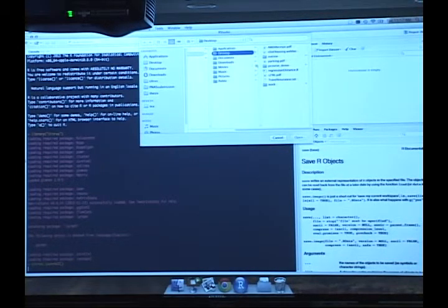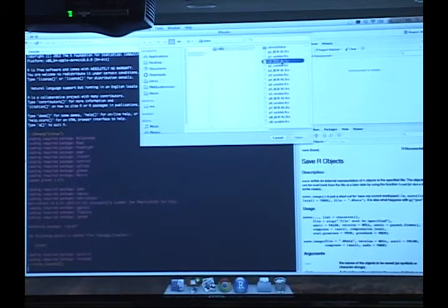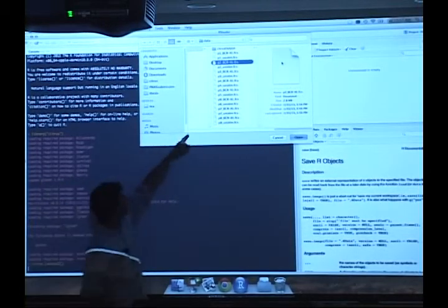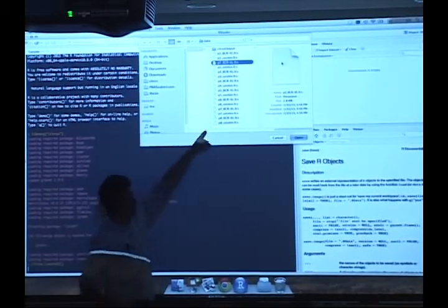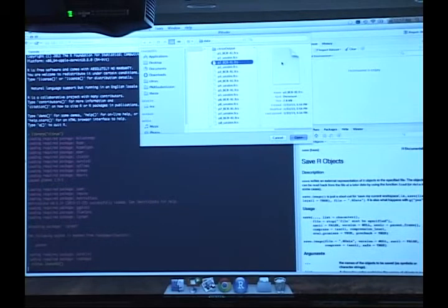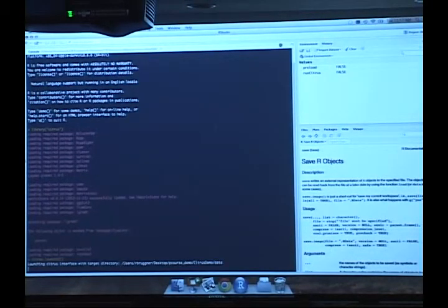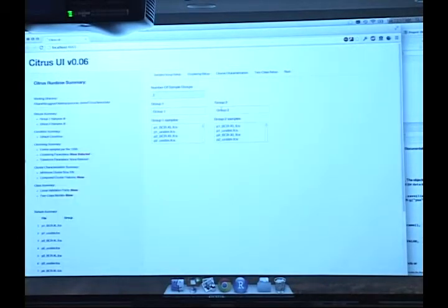So all you have to do is select one of the FCS files that you're interested in looking at. So here are all the stimulated and unstimulated FCS files that I analyzed in that last example. And after you select that, it will pull up a web interface. And here are the different samples that you're looking at.